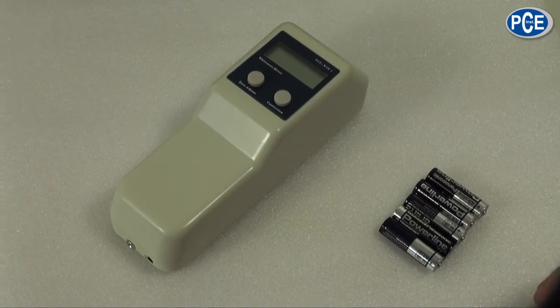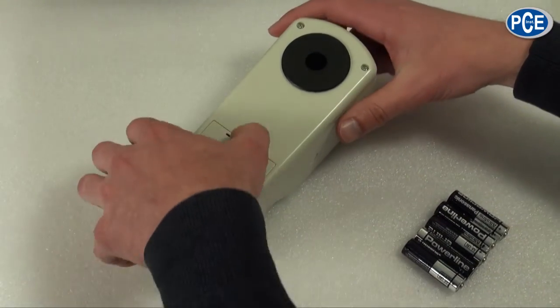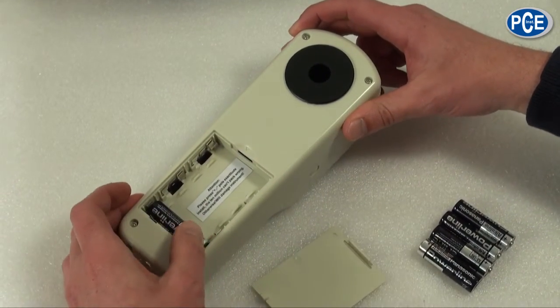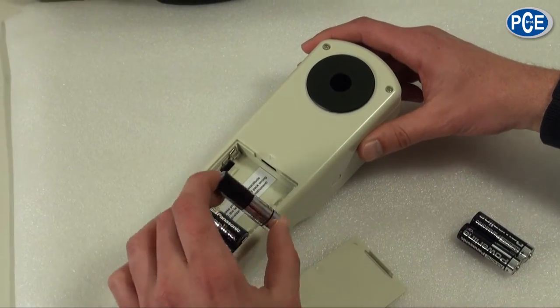Now we come to starting the WSB1. For this we turn the measuring device onto its reverse side and take the battery lid off. When putting the batteries inside it is important to watch the polarity. The polarities are marked on the base of the battery compartment.